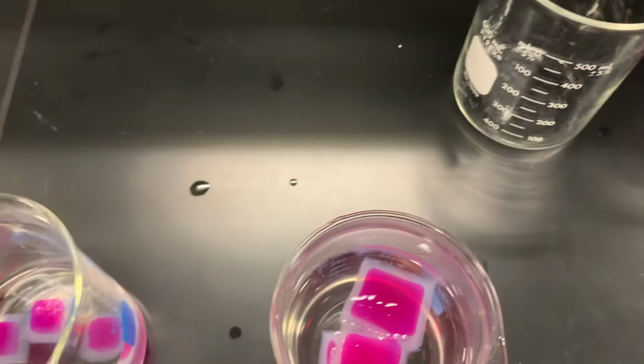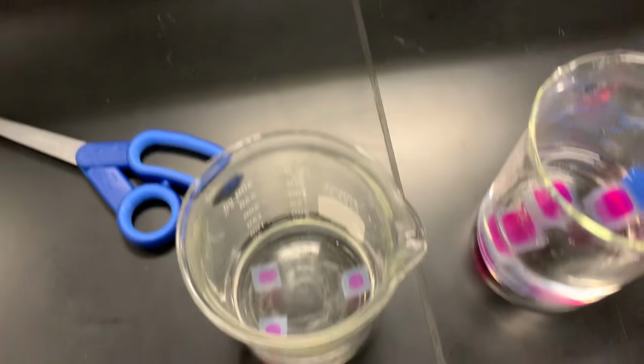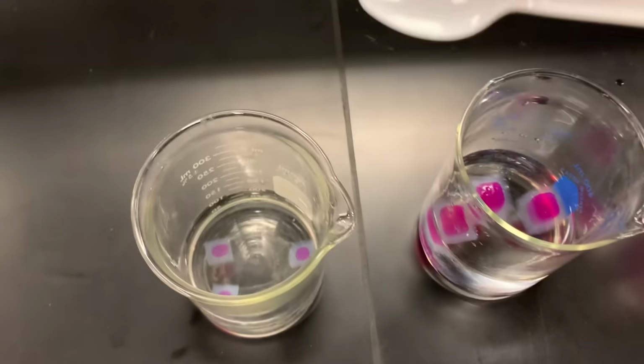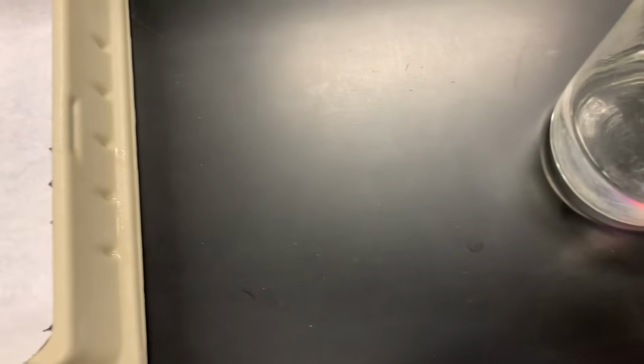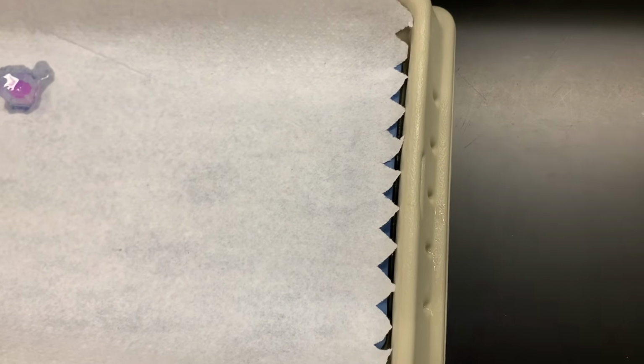So what I'm going to do is I'm going to pull them out. Again, please be careful, guys. This is hydrochloric acid, so you do not want to get it on your hands. So I'm going to use my trusty little spoon here. And once again, I'm going to put them on my dissection tray.